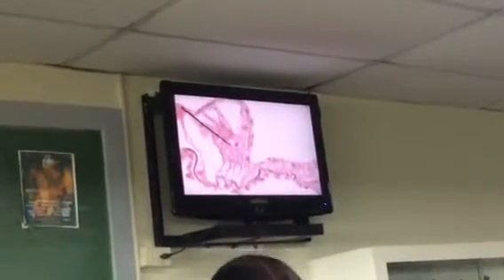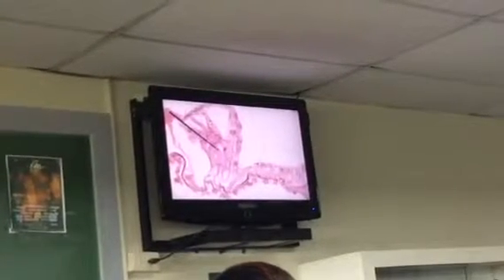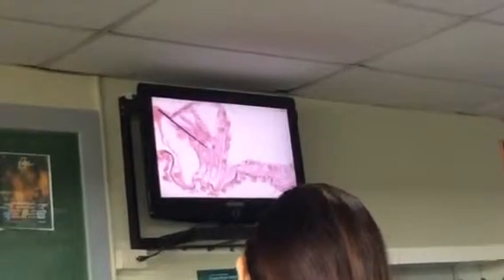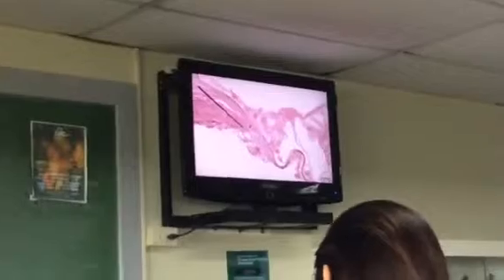So the hair cells, once stimulated by the movement of the endolymph, of course, the waves of your endolymph, this would now cause your hair cells to be stimulated to produce your nerve impulse. Now, I'm not going into that physiology. Saka na tayo mag-aral nun. Okay? Anyway, so again, as you said, this is your basilar membrane.